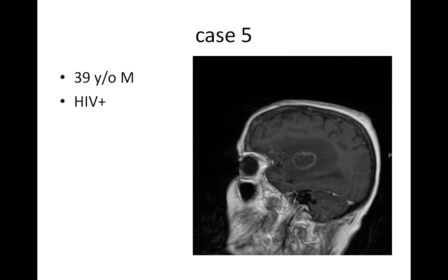So that was a little bit complicated, but again, having a good rapport with a neurosurgeon helped a lot. Now, having not just the radiology, as I've shown you, I always like to look at the radiology before I do an intraoperative diagnosis, before I do a consultation like this. Otherwise, I'm flying blind. I especially want to know the patient's history. This is a great example of where you needed to know the patient's history. I look at that lesion right here. It's a ring-enhancing lesion in this 39-year-old guy. It looked exactly, radiologically, like that case I showed you from case 1, that ring-enhancing lesion.